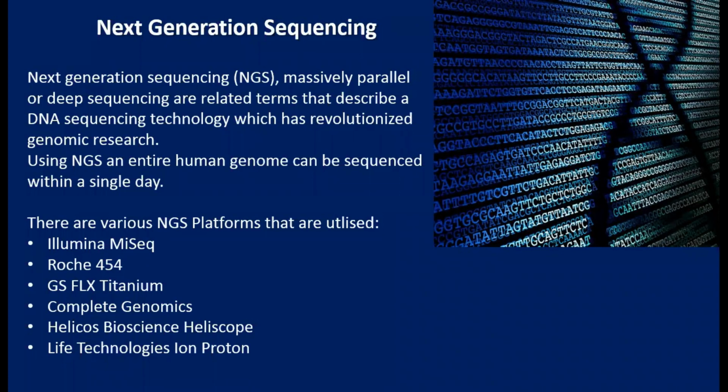Before proceeding with next generation sequencing, the same thing applies here as well. You have to have your data set ready with you. You can upload your data set on a cloud server wherever you want, and there are different platforms that provide you the opportunity to upload your data sets and then do the sequence analysis.